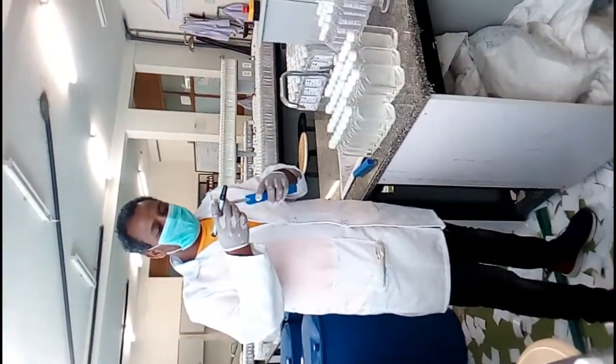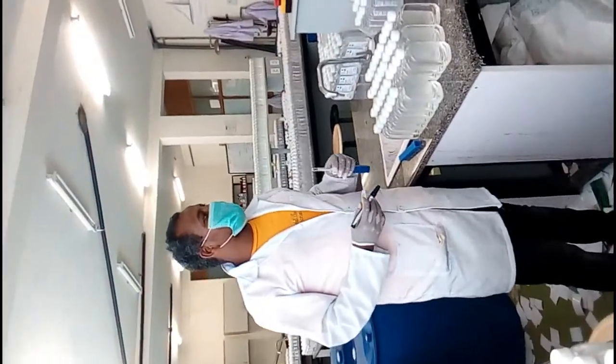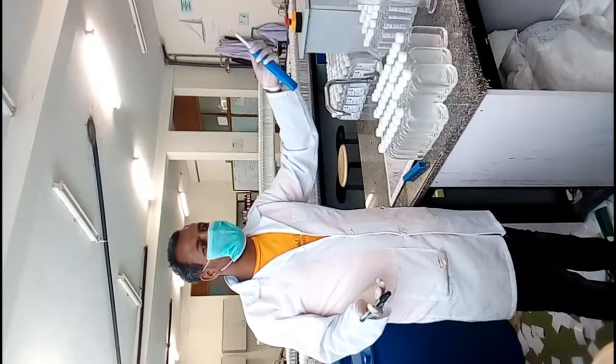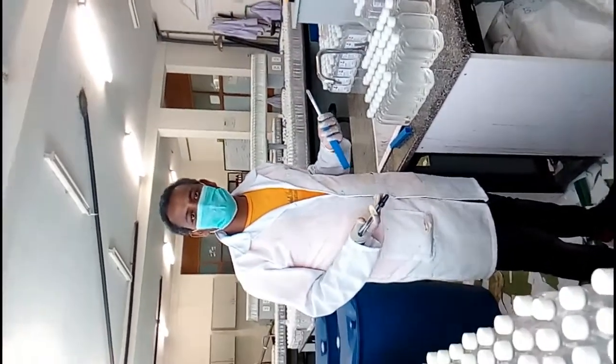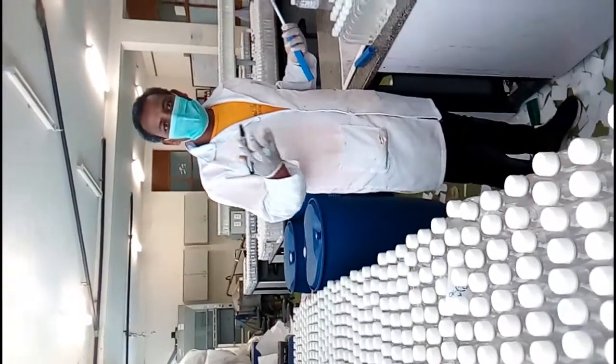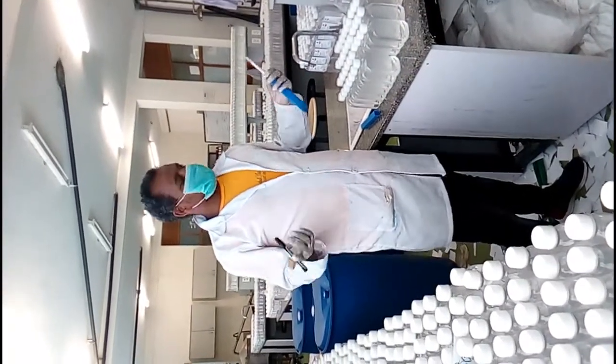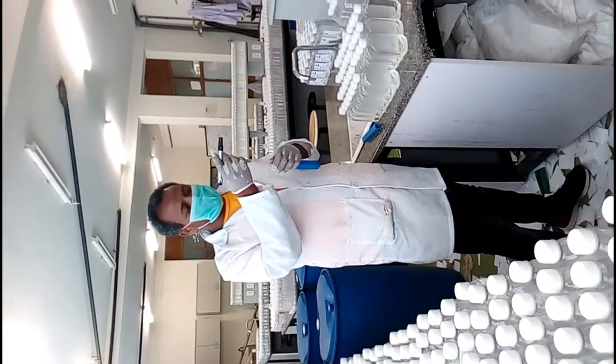Okay, let's start now to check whether this prepared ethanol, as we discussed before, the percent of alcohol in our sanitizer is approximately 80%, we said before. So how can we check this content, whether it contains 80% or not? We can check this by using the alcohometry.